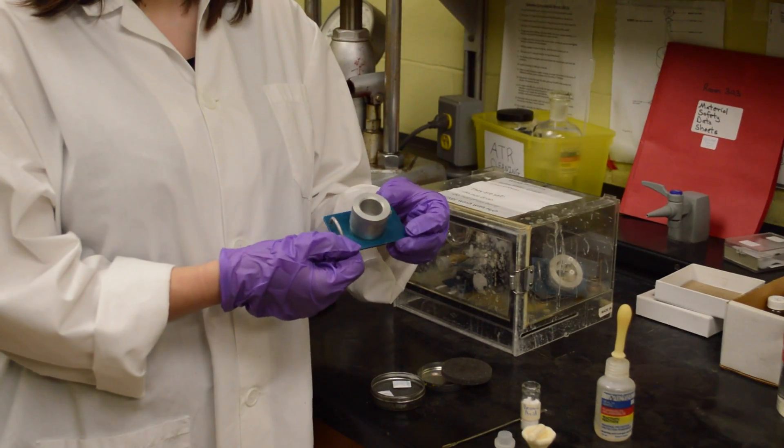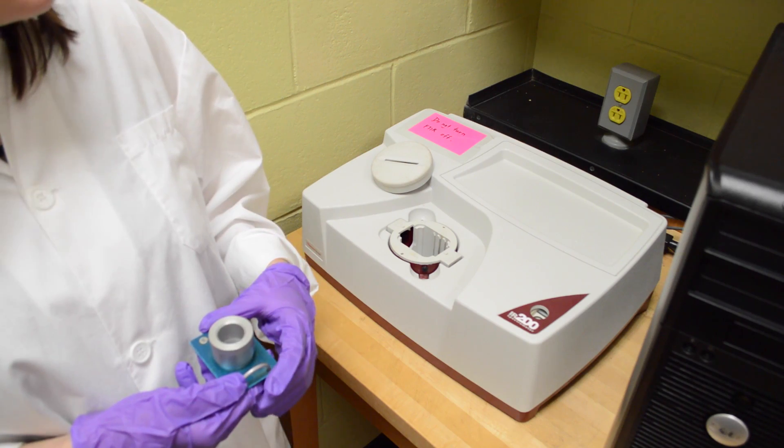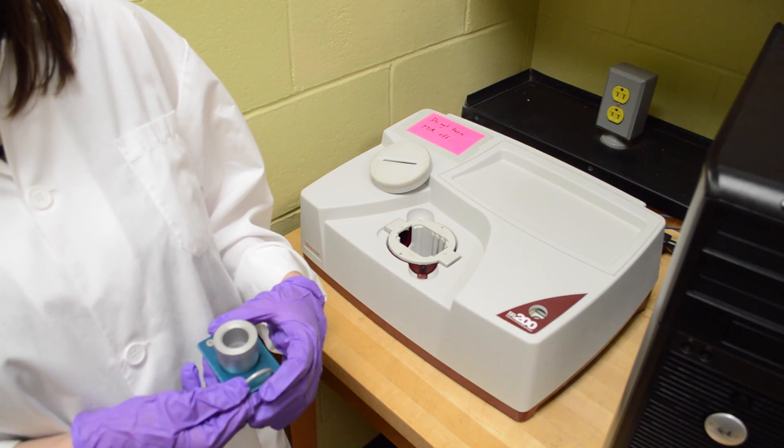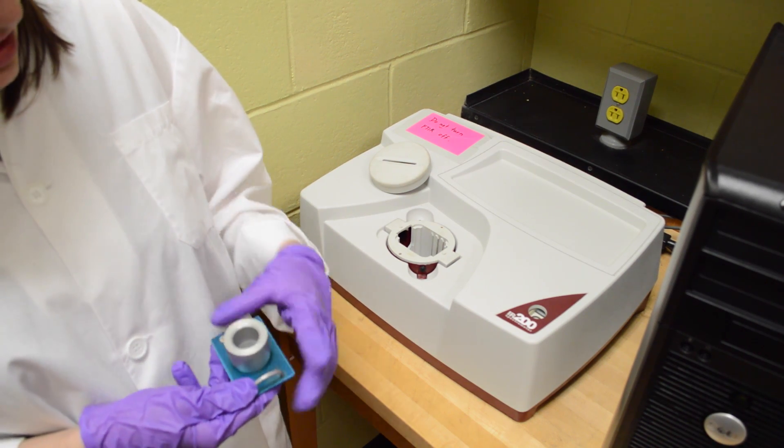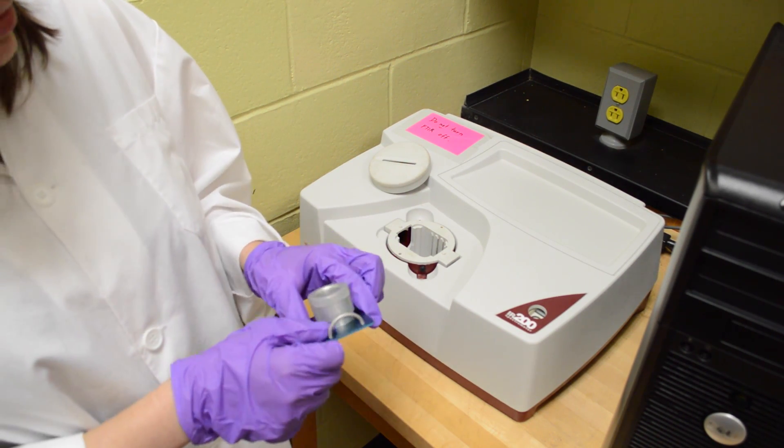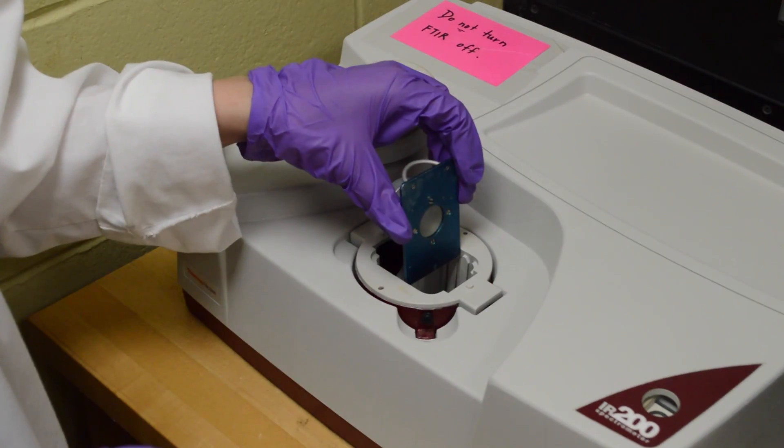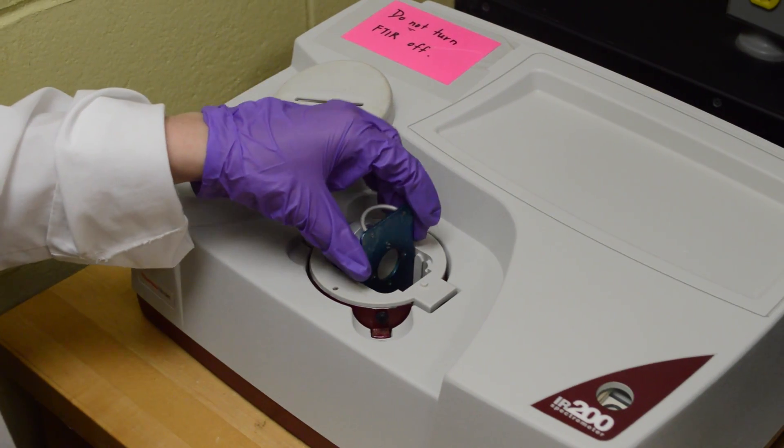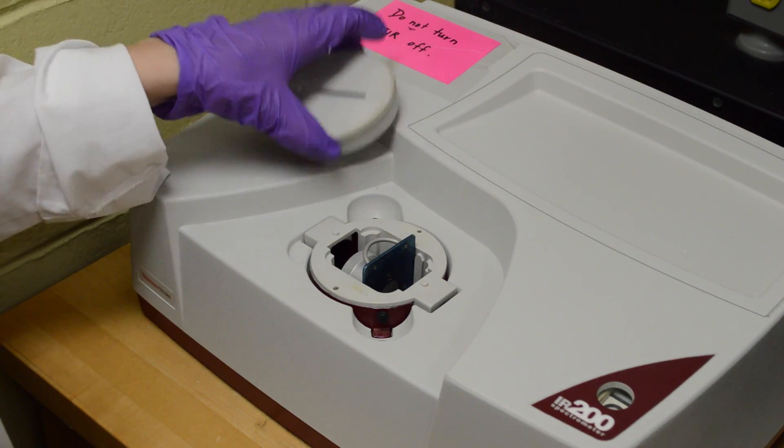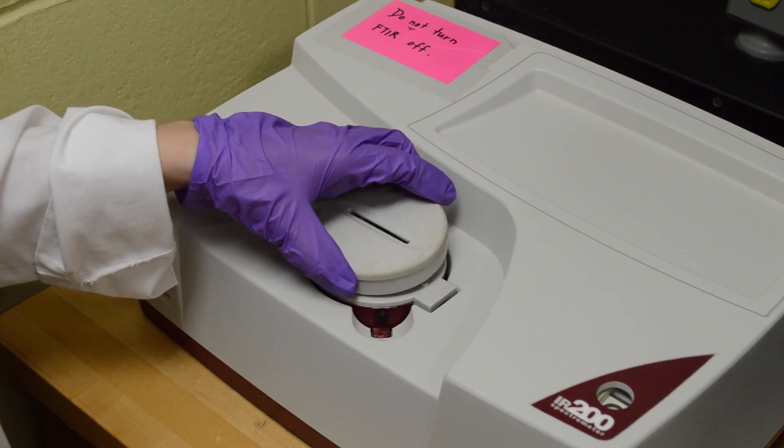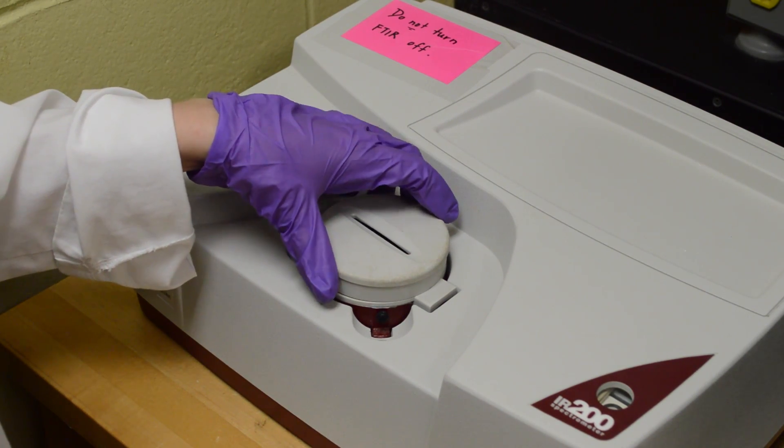We'll take it over to the spectrometer. Once you've collected your Nujol background and you're ready to load your sample, just take your sample inside the plates and the holder. Insert it into the slit within the machine like so, and then cover it with the cover. And you're ready to go.